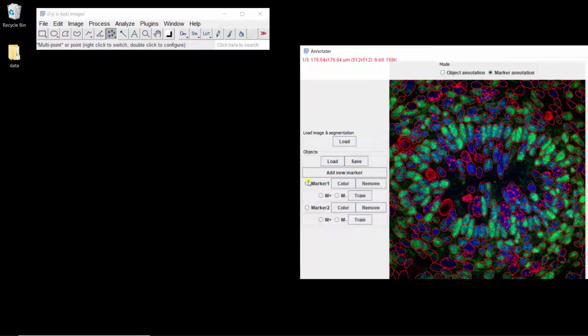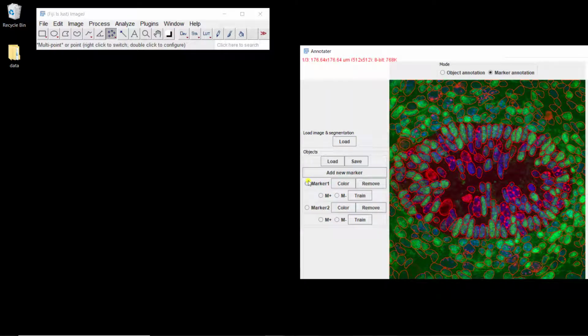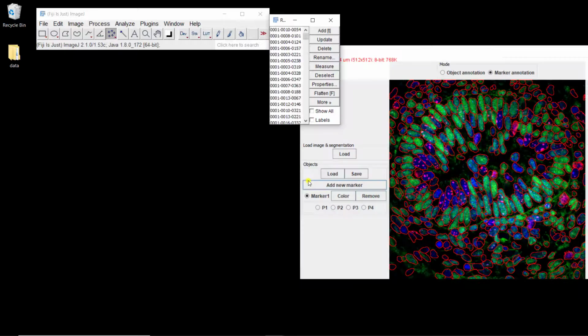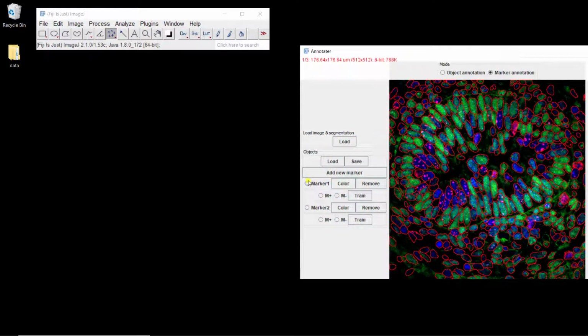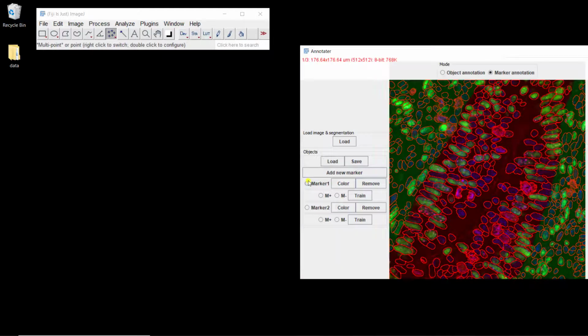So basically it's loading the images and the segmentation and the regions, and then applying the logistic regression to define the markers. And it's doing it for each image. So here we have 4 images. So I did the first image and now the second. So now you see it's not that long, but I'm just going to speed up the video so you don't have to wait for everything. All right, now it's done.